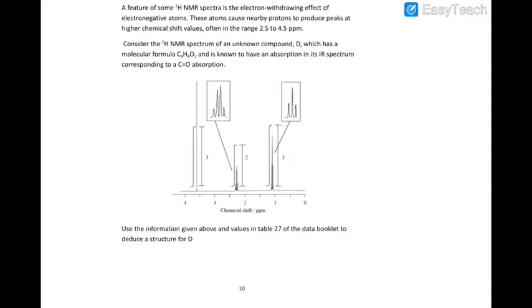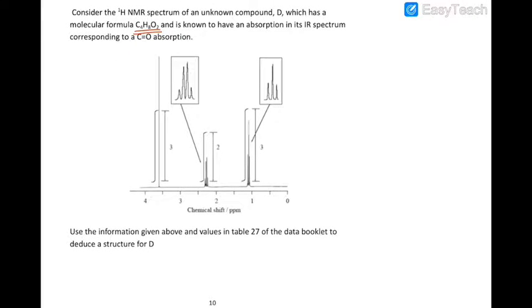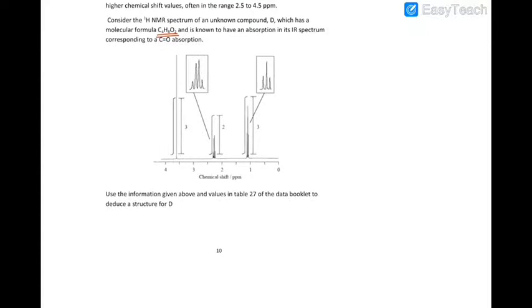So let's consider the molecule C4H8O2. The spectrum is shown. The first thing before trying to deduce any structure is to find the IHD. It has an IHD of 1, and this can be interpreted as it having one double bond in the structure. And since it has 2 oxygens, most probably there should be a C=O.